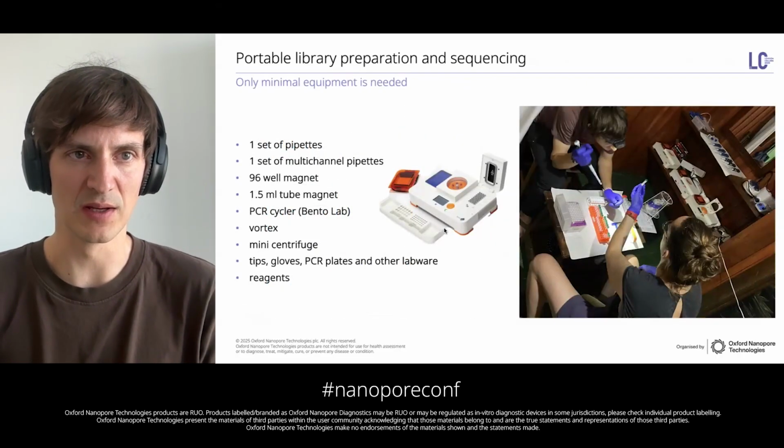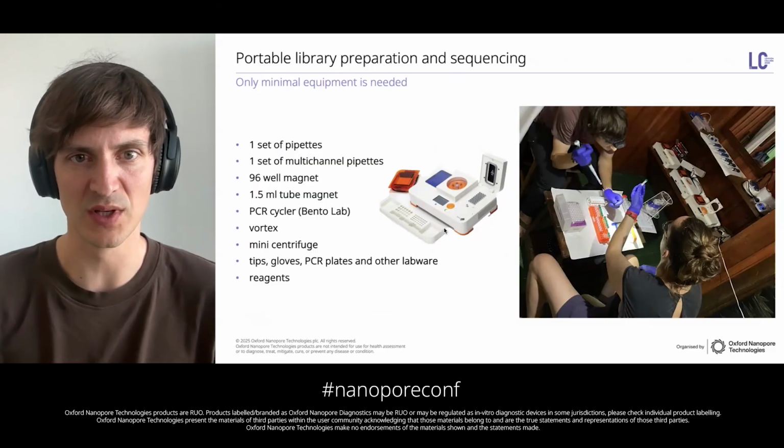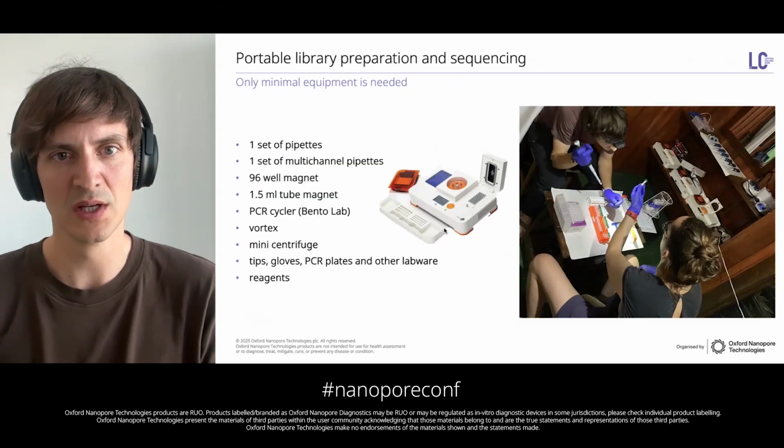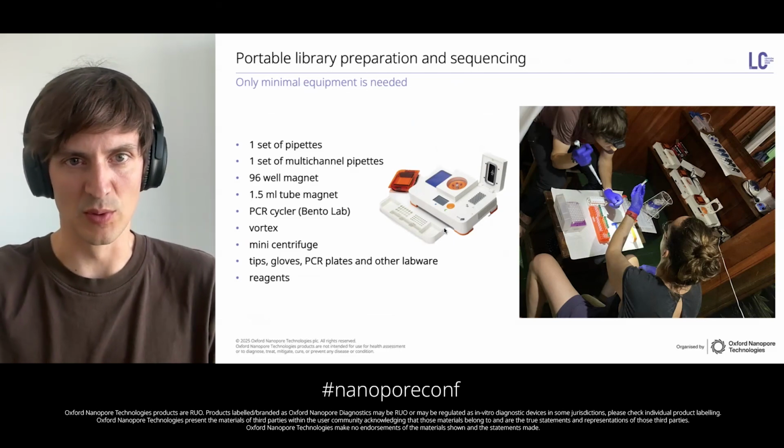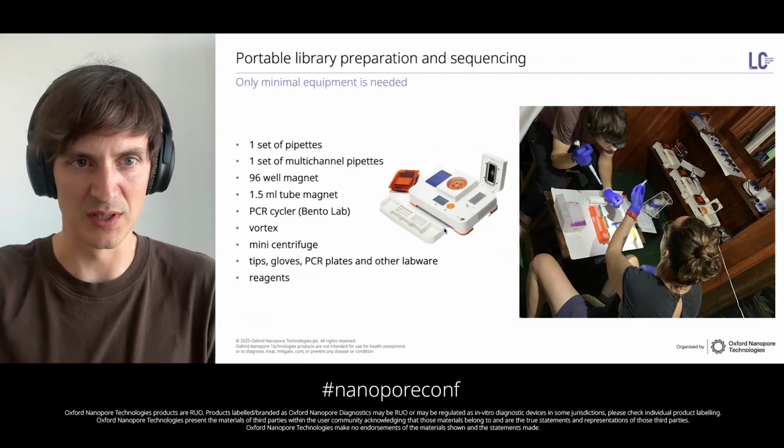So in the end, we had a very portable solution, and here you can see me and my colleague Esther Lizano in a cabin in the rainforest performing this protocol with a minimal set of equipment that you can see listed here.